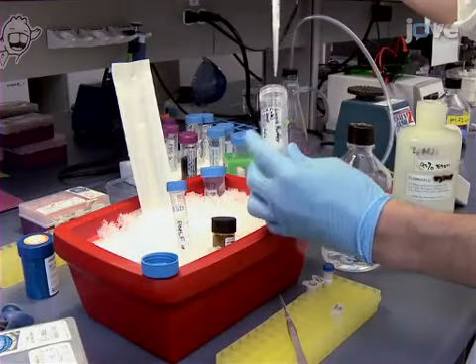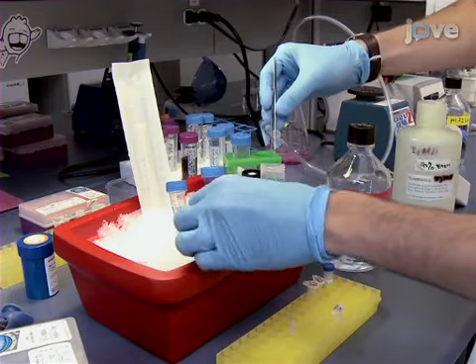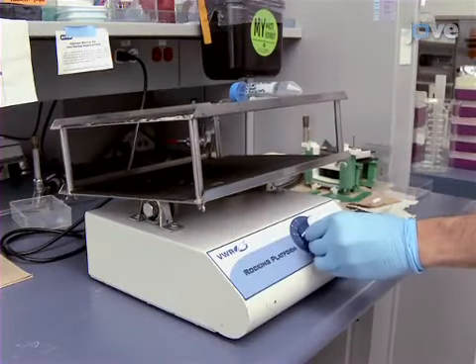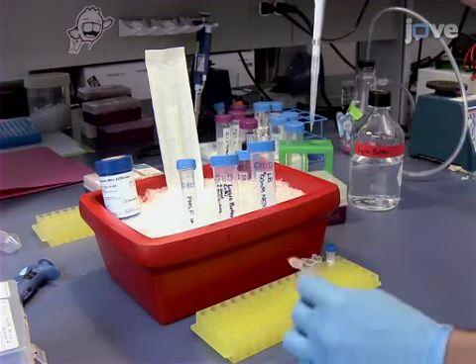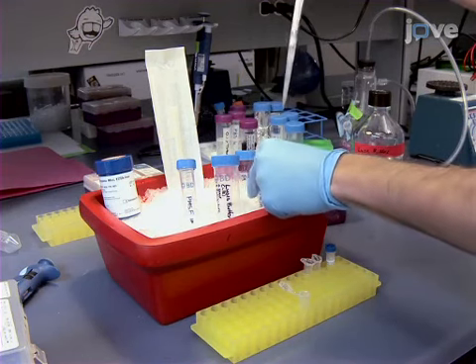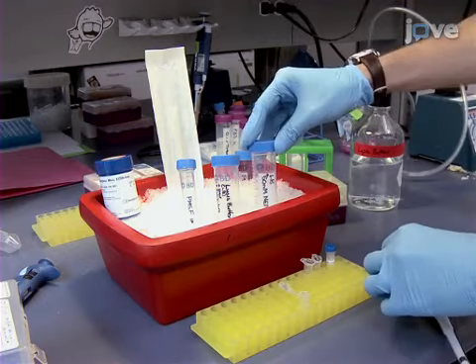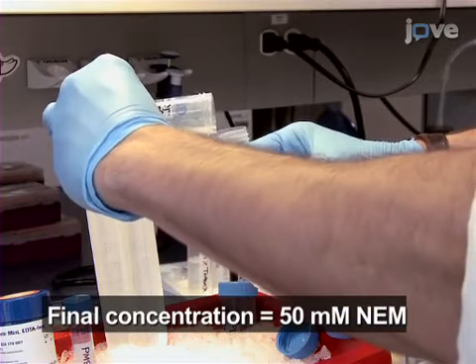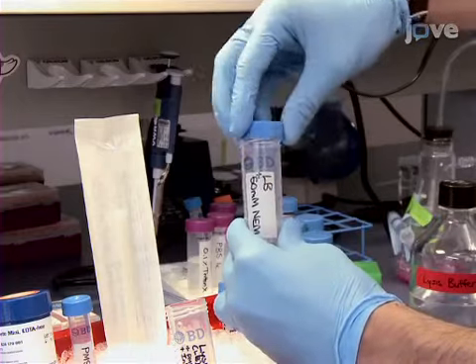To begin extraction of target protein from cultured primary hippocampal neurons, prepare the lysis buffer and NEM solution as described in the written procedure accompanying this video. Next, combine the lysis buffer and NEM solution by adding 0.5 milliliters of 2 molar NEM solution to a fresh 50 milliliter conical tube. Add 20 milliliters of lysis buffer over the top. Always add the NEM ethanol solution first and the lysis buffer second, so as to properly mix the two.